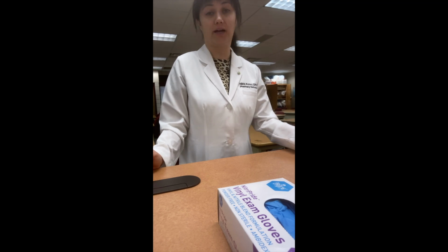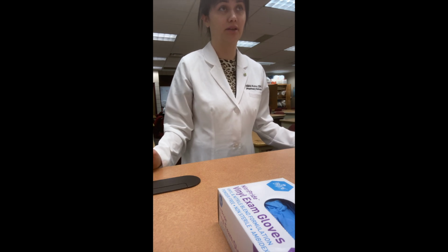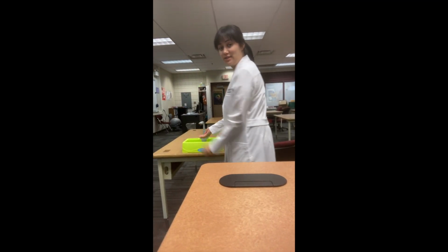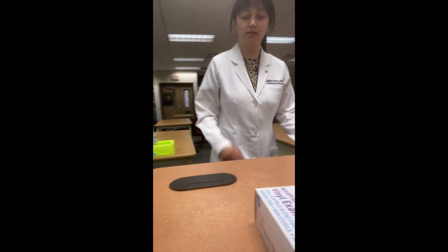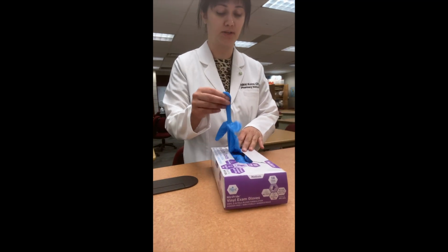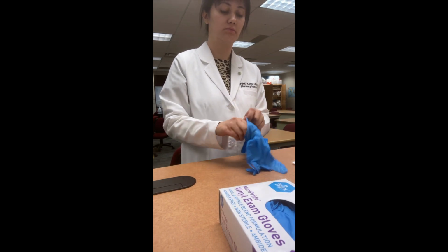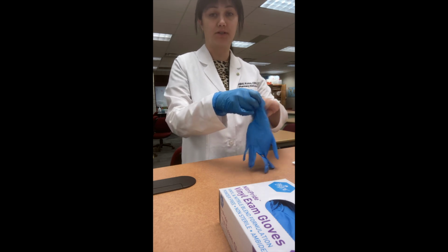So first off with our lab, we want to make sure that we're ready to begin work. The first step in any kind of compounding procedure is to make sure your hands are clean. So now you would sit there and wash your hands. This is my pretend sink. After that, you want to get a pair of gloves. Usually you'll use nitrile just because a good amount of people have latex allergies. And since this is non-sterile compounding, we don't have to use sterile gloves.